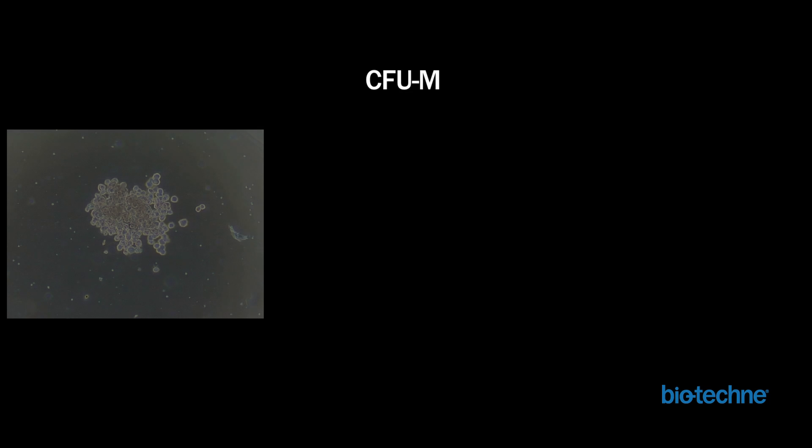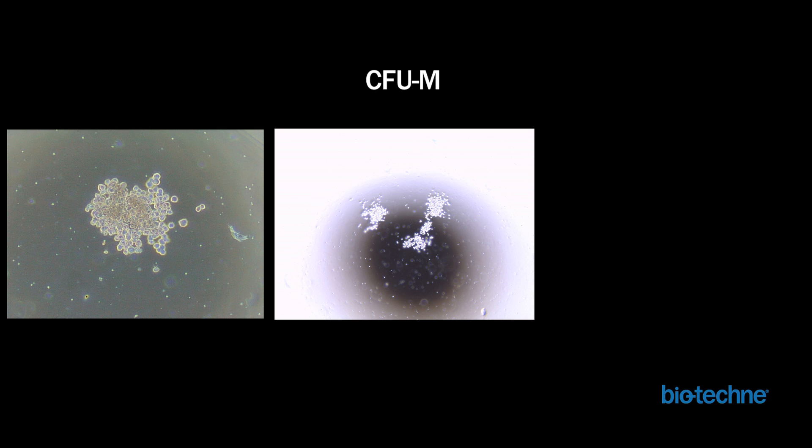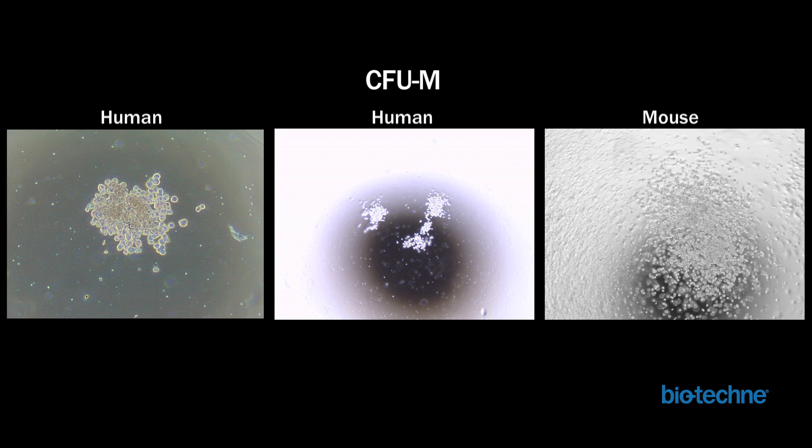CFU-M colonies, or macrophage colonies, consist of large, smooth cells that are loosely aggregated. The characteristic appearance is common for both human and mouse cells and is illustrated in the high magnification image of the human CFU-M colony on the left. CFU-M colonies can vary in size from small clusters, as seen in the middle image, to larger, more spread out clusters, as seen in the image on the right.